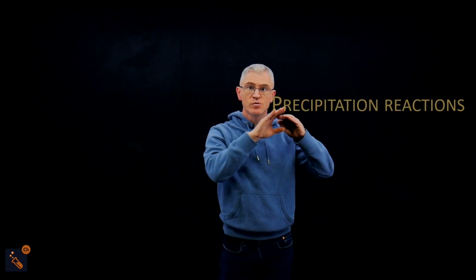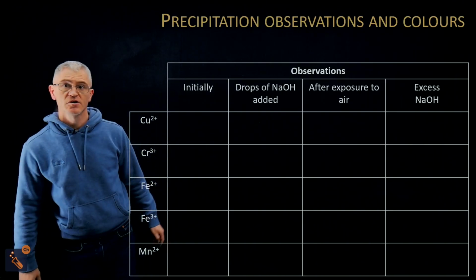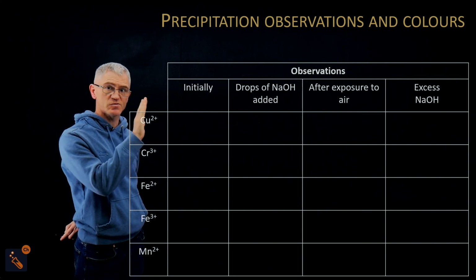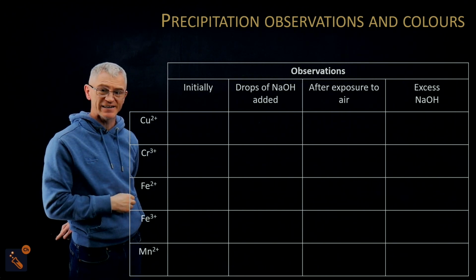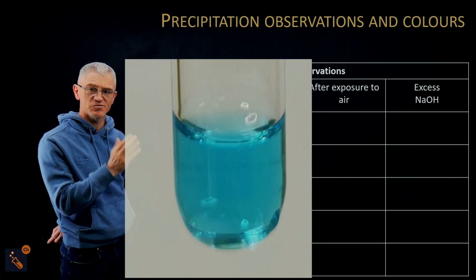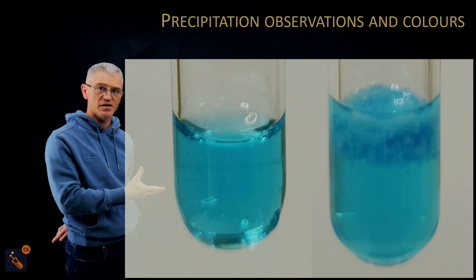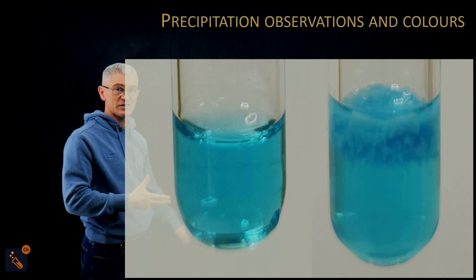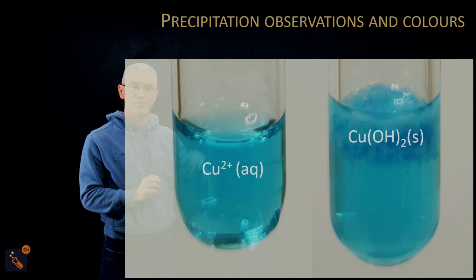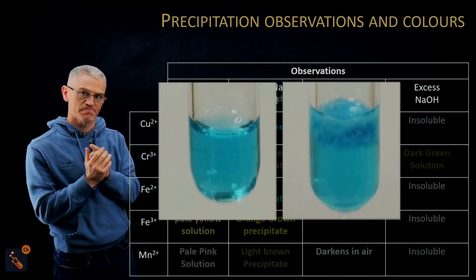So today we're going to do precipitation. Right, okay, so we have got our table here, which we need to remember. Now, we've got drops of sodium hydroxide added here, but it actually works with ammonia as well. Okay, so what we've got here is your pale blue solution for your copper 2+, and then you make your blue precipitate there. So that's copper 2+ changing into copper hydroxide, and that's whether you add ammonia or you add sodium hydroxide.